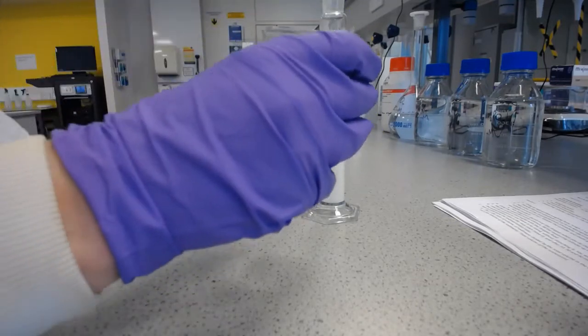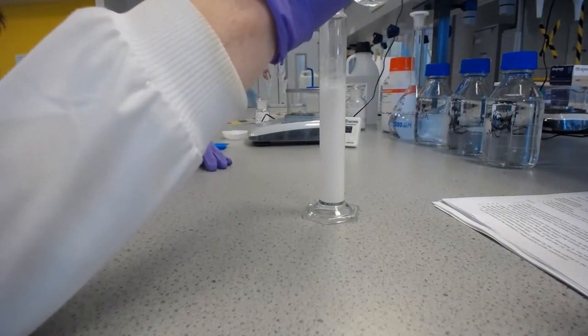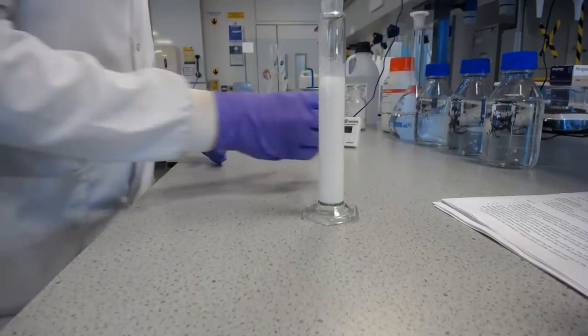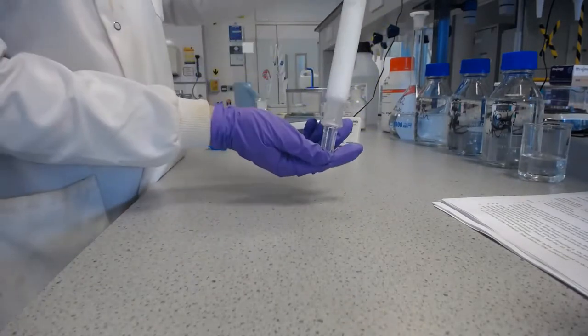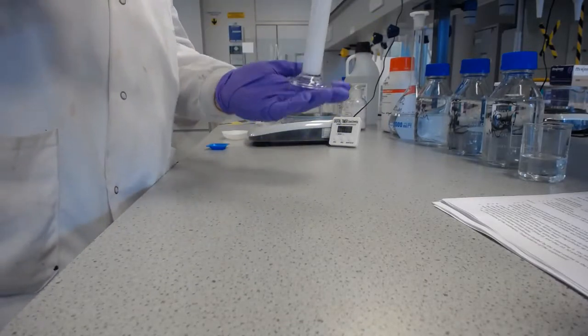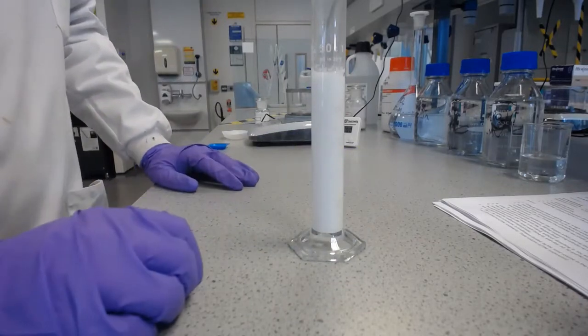Now, I would lift that up normally, but for the sake of the camera, I will bend down and get that up to 50 millilitres. Okay, so I'm now just going to give that another mix with the stopper firmly in place. And that is the first of the suspensions made.